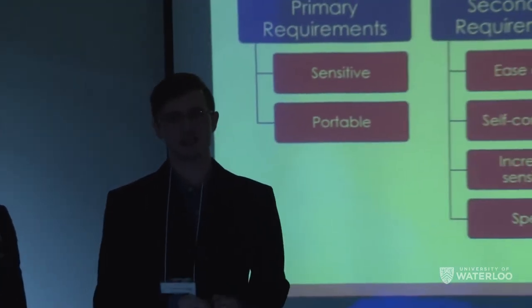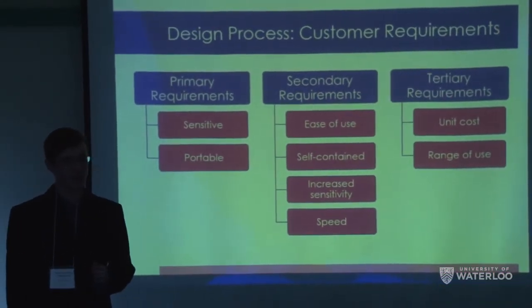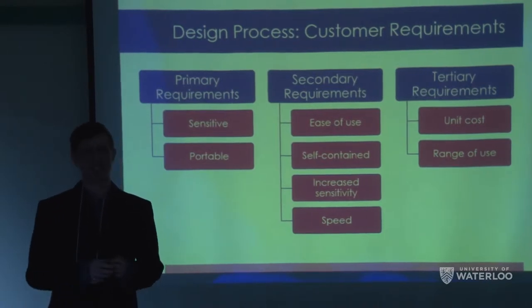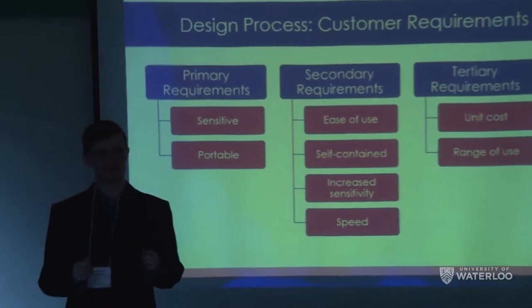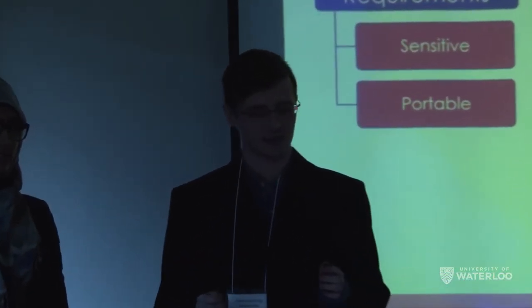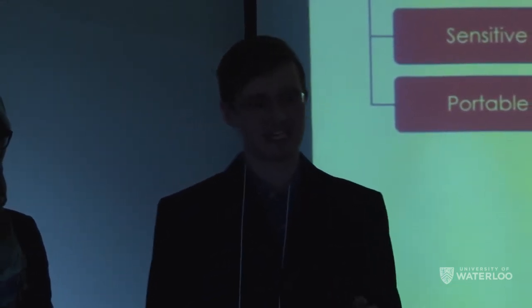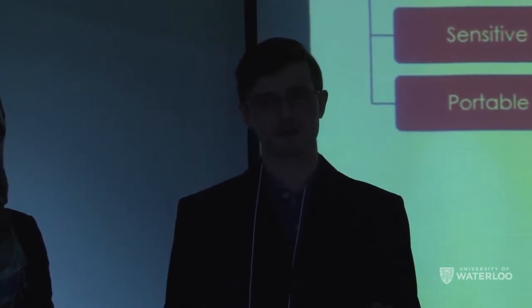So talking to celiacs and other people who couldn't consume gluten, we came up with a set of customer requirements. The primary requirements were sensitivity, so it needs to be able to detect foods that have 20 parts per million of gluten, and it needs to be able to show that these foods aren't safe for the consumer. The second primary requirement is portability.